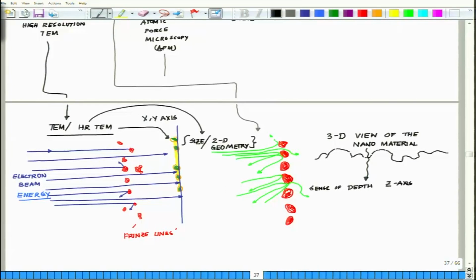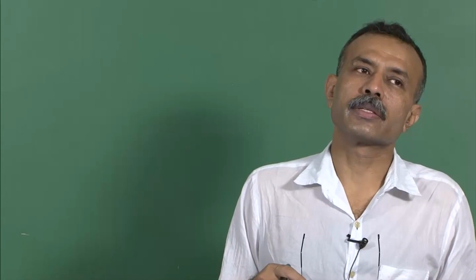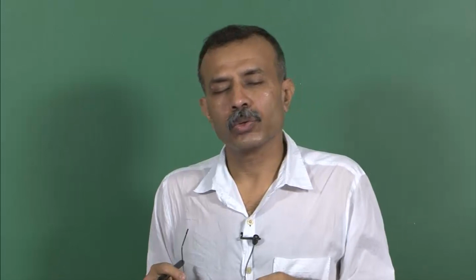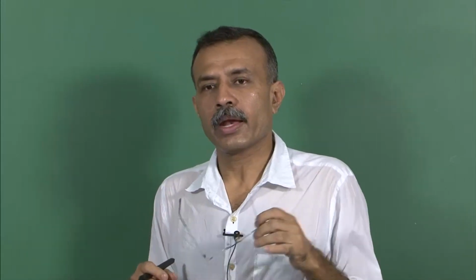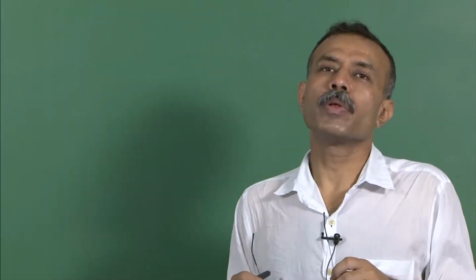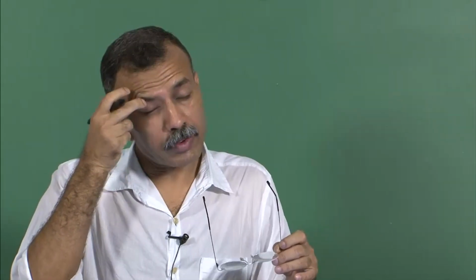Whereas when we talk about the SEM, we get a three-dimensional view of the particle. So you see, the techniques complement each other. They help each other to build up the story of things which cannot be seen so easily through light microscopy, and that's where we say the different techniques complement each other to tell you a story which is never told before in the history of mankind.